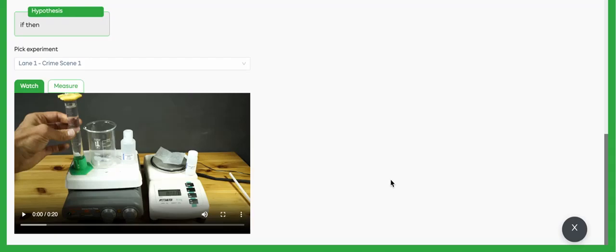Welcome to the DNA fingerprinting smart science measurement help video. This is one of our three gel electrophoresis labs. They're all very similar, so we're going to do this video and this should cover the idea of how to measure from gel electrophoresis for each one of these different labs.